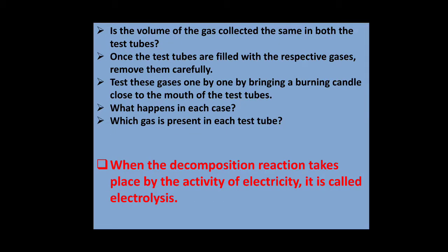Is the volume of gas collected the same in both the test tubes? Once the test tubes are filled with the respective gases, remove them carefully. Test these gases one by one by bringing a burning candle close to the mouth of the test tube. What happens in each case? Which gas is present in each test tube?